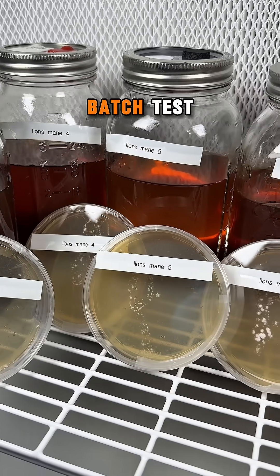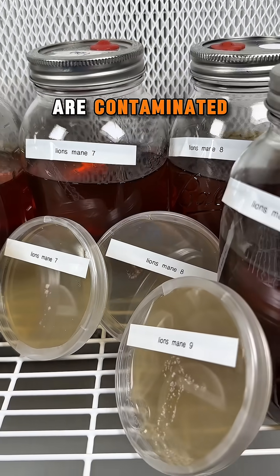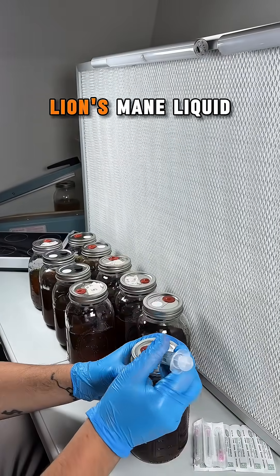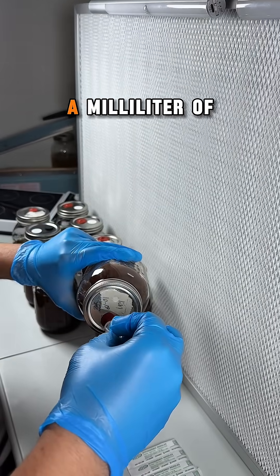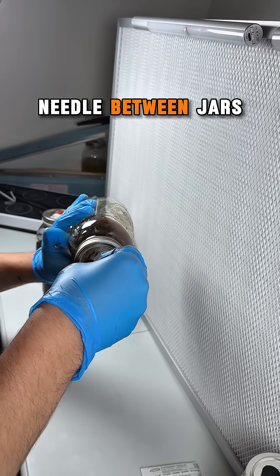I'm going to show you one way that I batch test my mushroom liquid culture jars to see if any of them are contaminated. In this example, I'll be testing 10 jars of Lion's Mane liquid culture. Here I'm using a sterile syringe and needle to extract half a milliliter of liquid culture from each jar, using a new needle between jars.